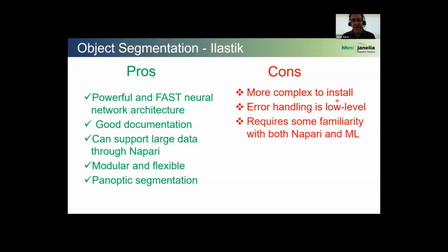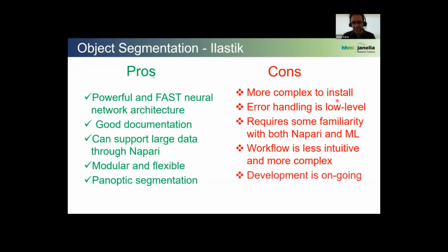But on a general level, this wouldn't necessarily be the software I would go to if you're not familiar either with machine learning or Napari. If you do want to use this, I would say take a little bit of time and learn a little bit more about the underlying technologies that support this software before you jump right in. The workflow also is not this nice wizard, step 1, step 2, step 3 interface, and so you really have to understand exactly which module is appropriate to use at which point in the process.